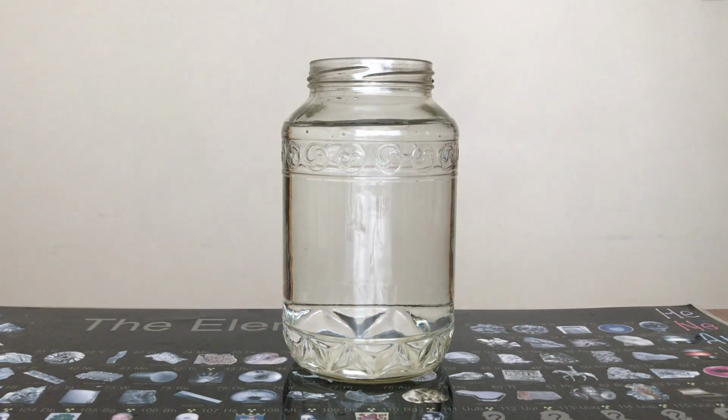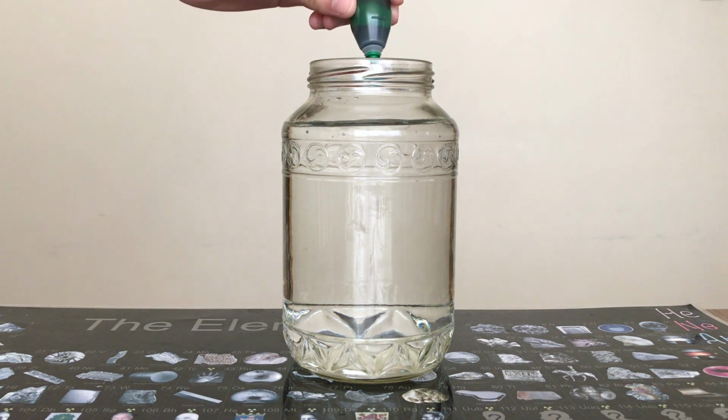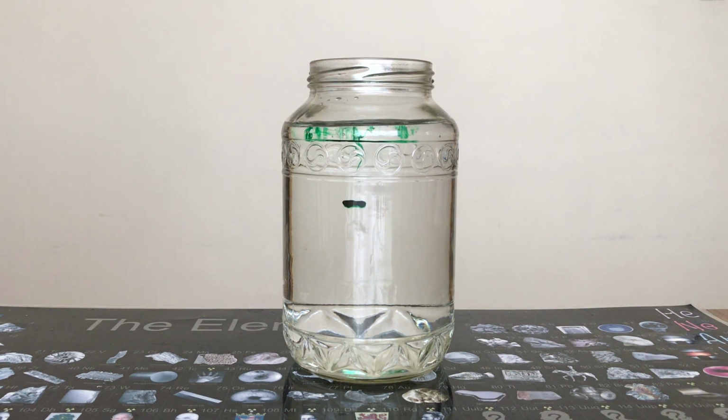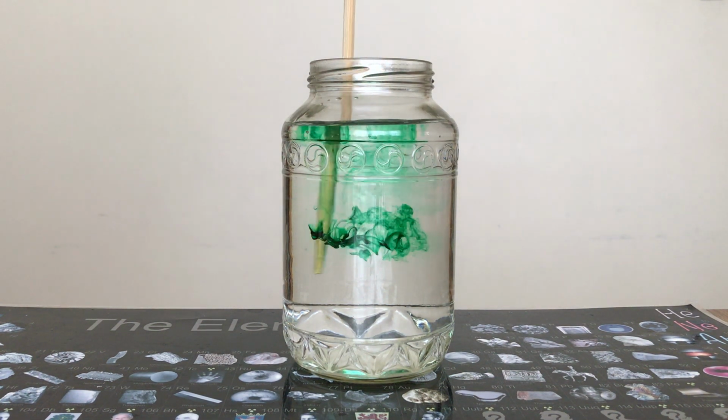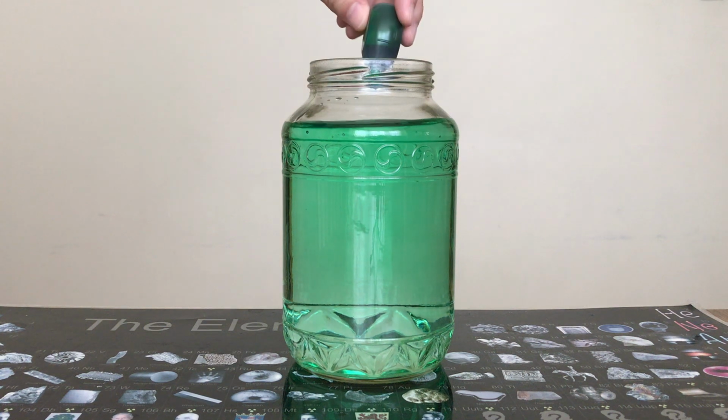You probably already have an intuitive idea that the color of a solution is related to the concentration of stuff that gives it color. If we add food color to clean water, the more food color we add, the stronger the color. The water is called the solvent. The stuff that gives it color is called the solute.